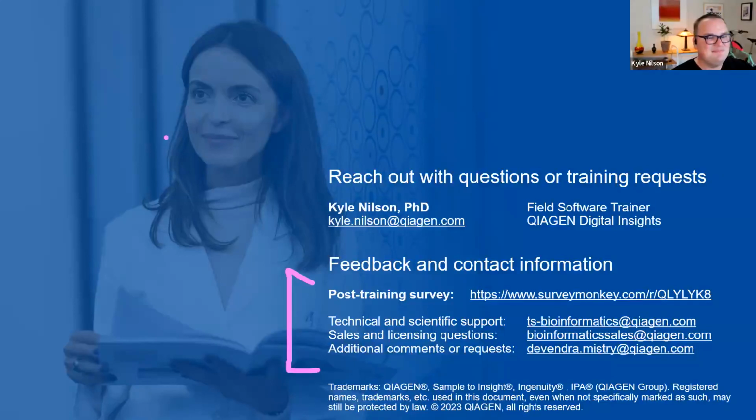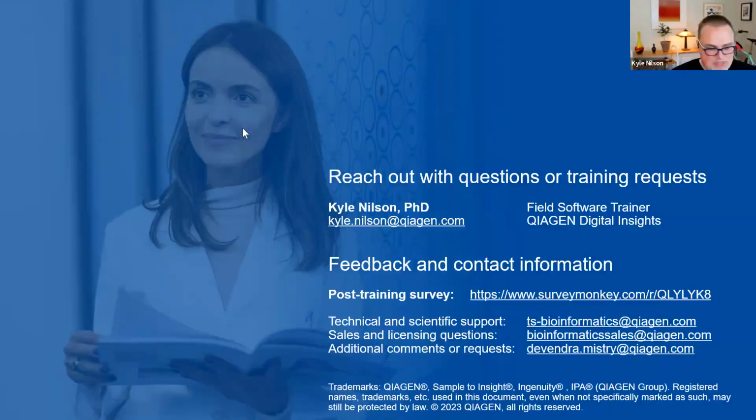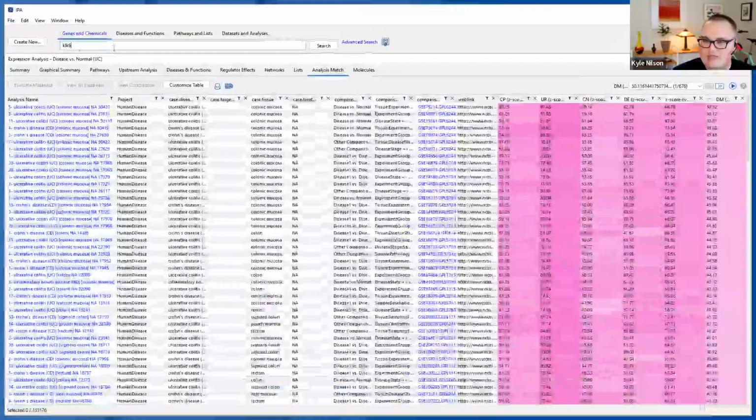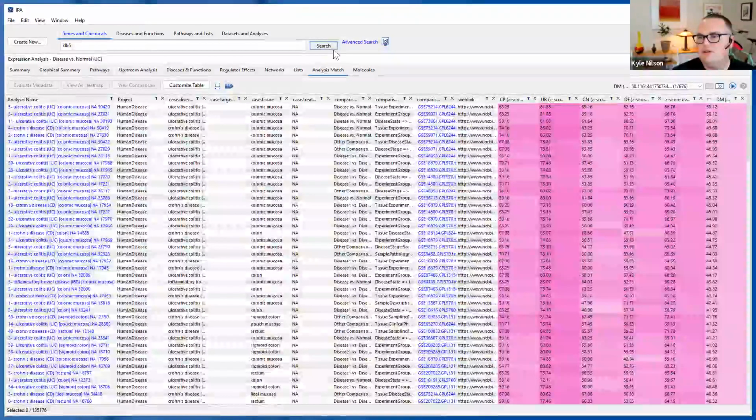All right, so while attendees are typing in their questions in the Q&A box, one thing that did come to mind, Kyle, is there a way to get the statistics in Land Explorer for a particular comparison, let's say? That is a good question. The answer is yes.